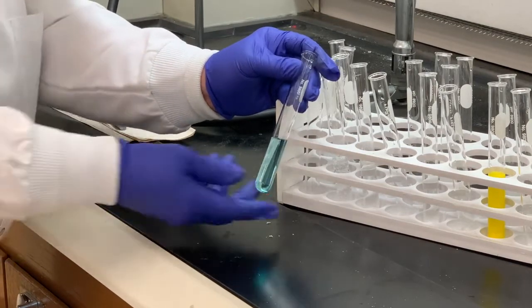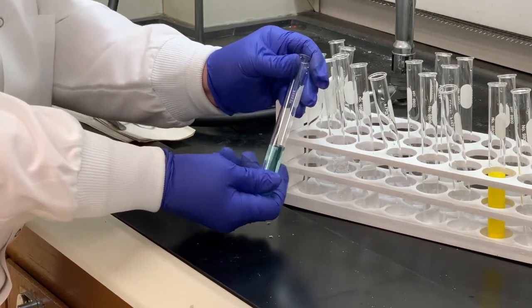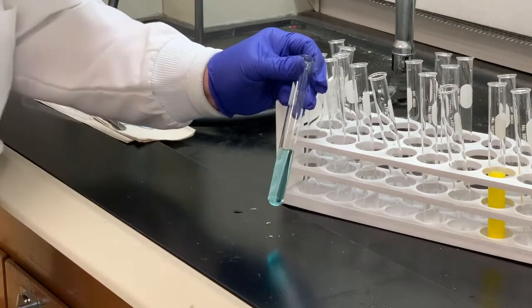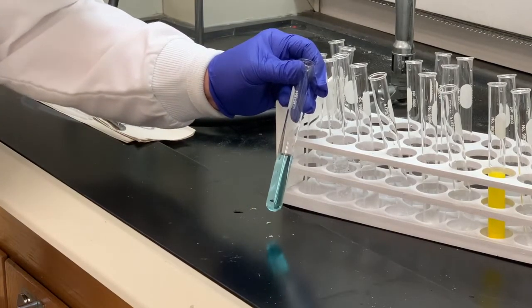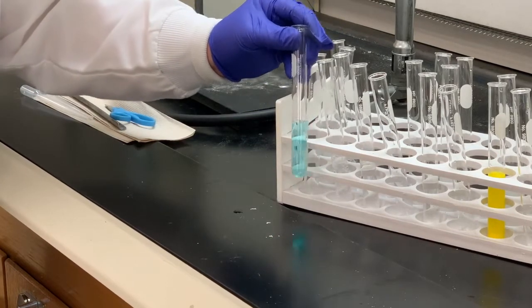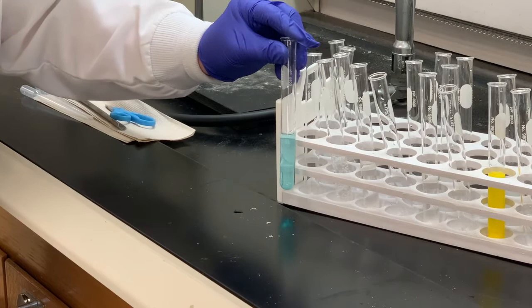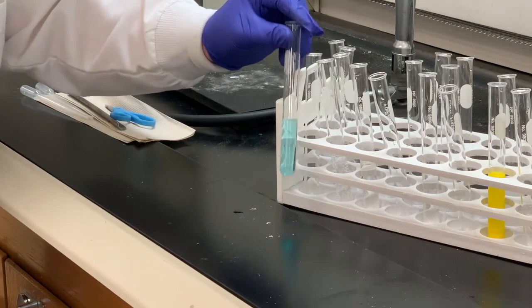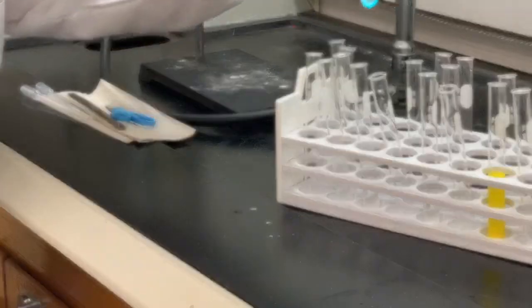Can I see through it? Yes. So no precipitate. I didn't see any bubbles. I didn't notice any temperature change. If anything, it may have gotten a little bit lighter in color. You can kind of see that. But is that indicative of a chemical change? No. So no chemical reaction for this one.